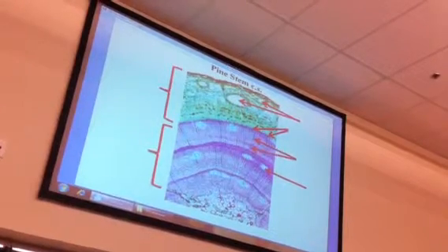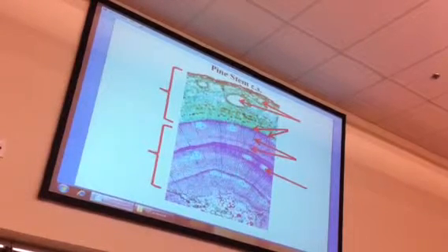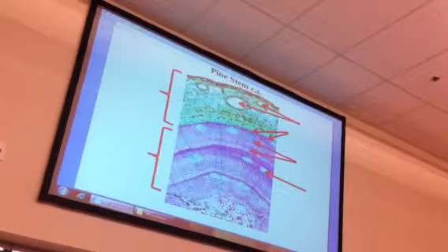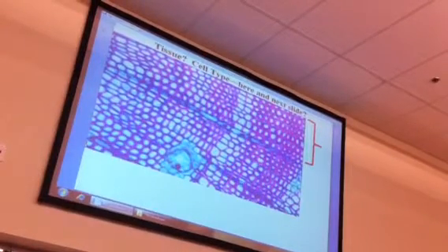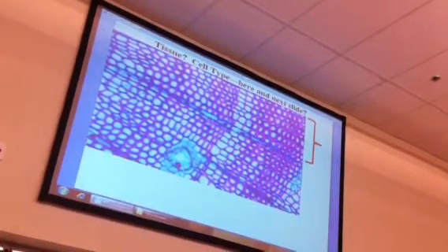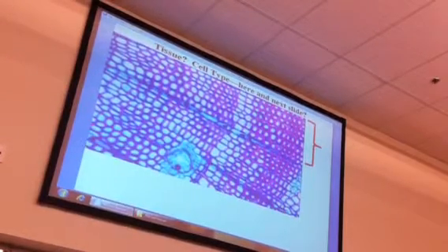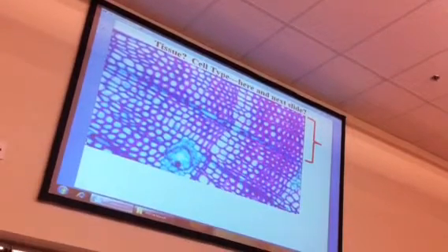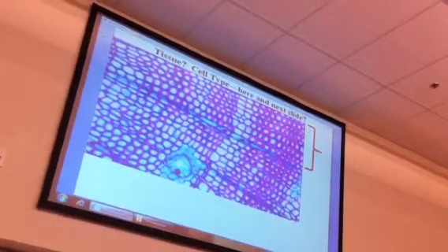Either one. It's not fibers, because there are no fibers in conifers. It's xylem, so xylem is the tissue. And then what type of cell would it be? And here it is enlarged. Tracheids. This is the first time we've really talked about tracheids, and this is what the lab said. Tracheids tend to be very angular. Look at how angular that is. And you look at all the vessels, things we covered before, vessels are very round.